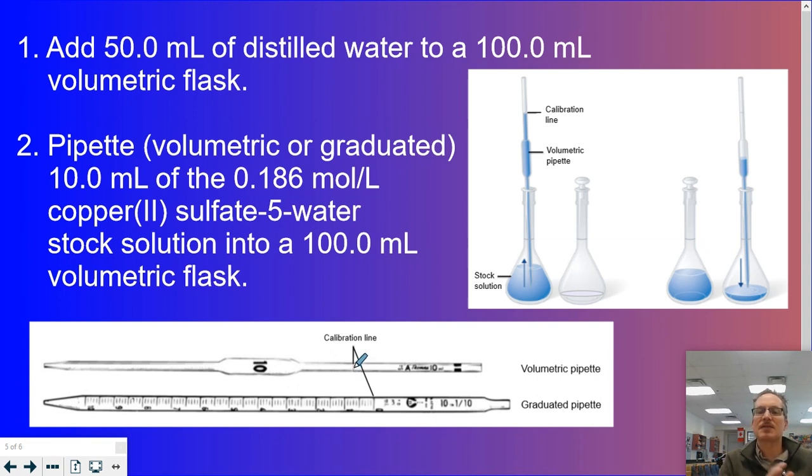I'm then going to transfer this over to my beaker or container, whatever I'm using, and I'm going to let go and let gravity pull the liquid down. Again, at no stage do I do anything more than let gravity pull it down. We're going to watch for splashing, but if we tilt it and pour it at its side when we're doing this, then we won't have any splash problems.